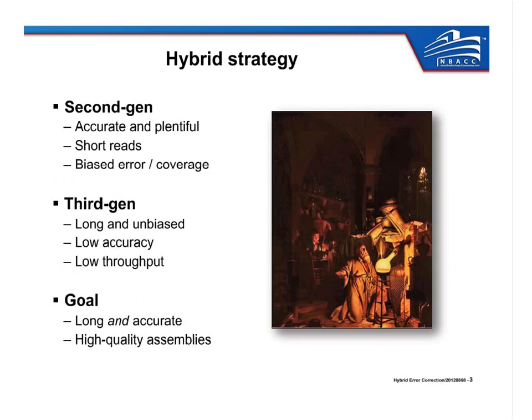So second-gen sequencing has been the landmark technology for the last 7 years, and the focus has very much been on short, high-accuracy reads that are very plentiful and huge throughputs. So this has driven down costs, increased our ability to do SNP genotyping and so on. But there are drawbacks in that the reads are short, so from transitioning from Sanger to second-gen sequencing, our ability to assemble these genomes was diminished quite a bit.